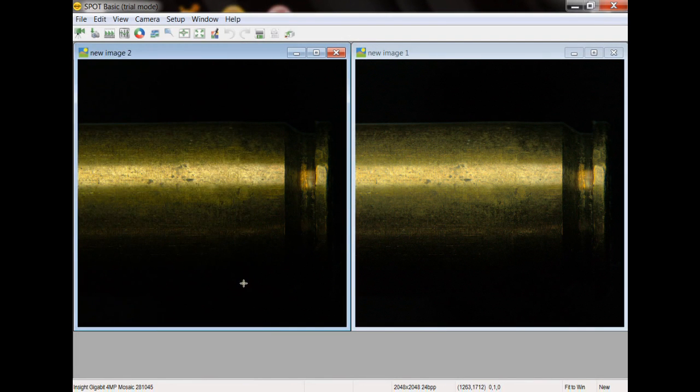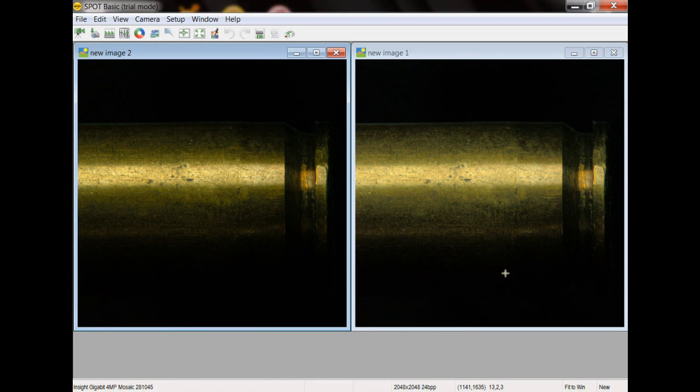Alright, so on the left we have the standard image without a gamma adjustment and on the right we have the underexposed image with the gamma adjustment.